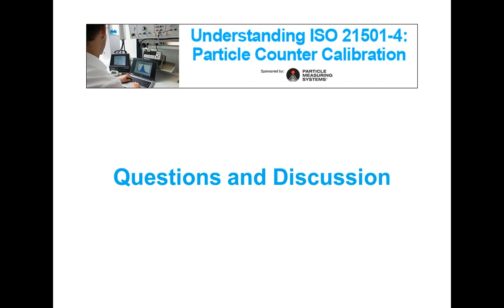Okay, and this one I think you touched upon before, but the question came in, how frequently do I need to calibrate my particle counter? So that must still be a question out there. Yeah, at least once per year. Once per year is the requirement of the standard.